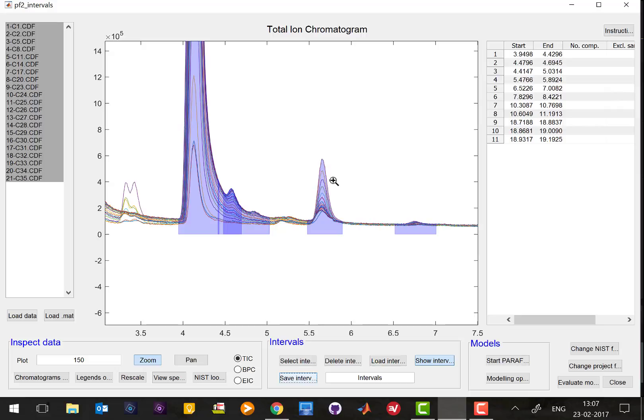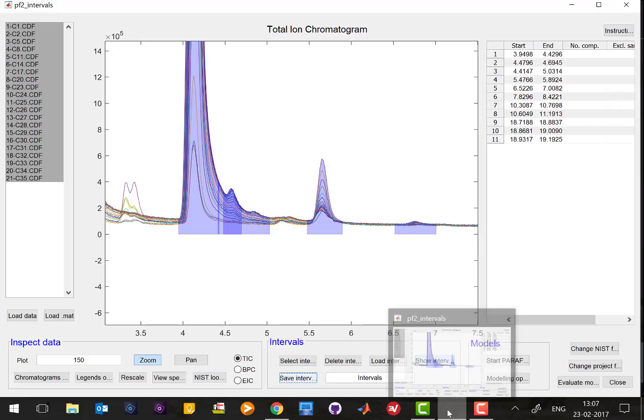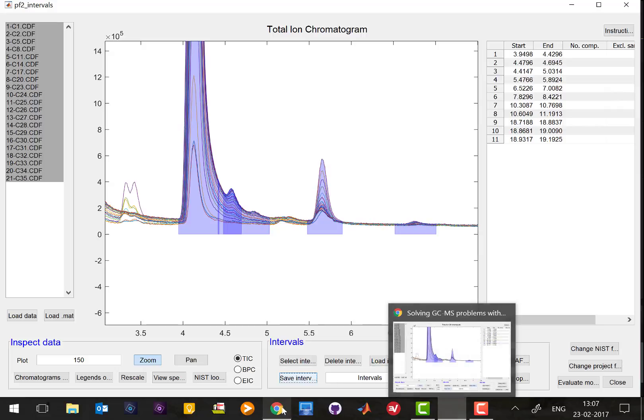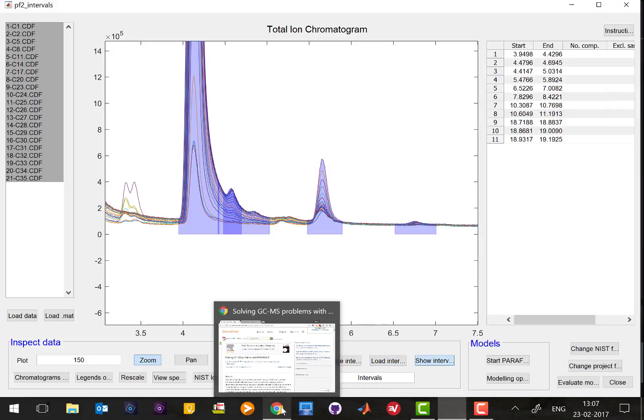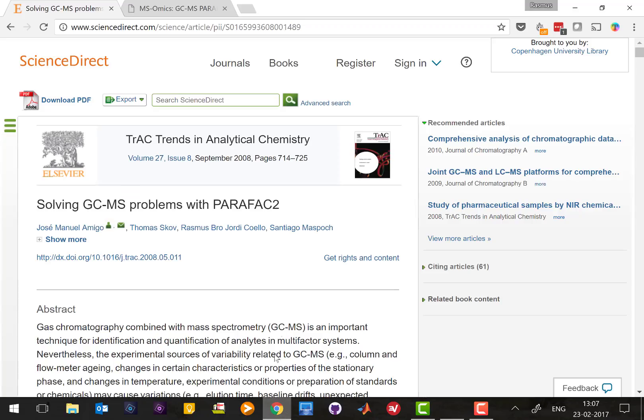All of this is done in what is called models and we're not going to explain in detail how the modeling is performed. If you're interested in these things you can Google PARAFAC2 and find out information on how PARAFAC2 actually models the GC-MS data.